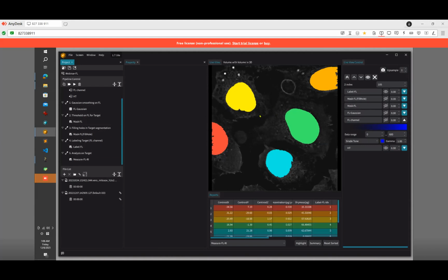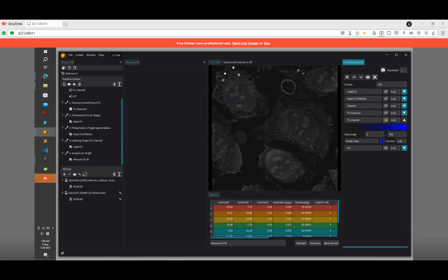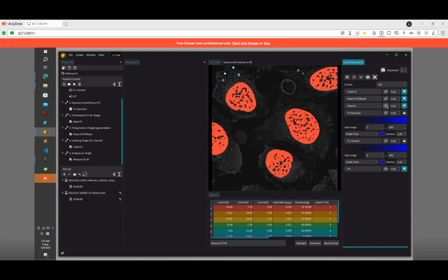What I want to emphasize again is that you can see all the data in the middle to see how it unfolds. So let's see again. At the beginning, it was like this. And we do some smoothing for a better analysis, some pre-processing to have a nicer thresholding. Then we make the mask based on this one. So this is the basic thresholding.